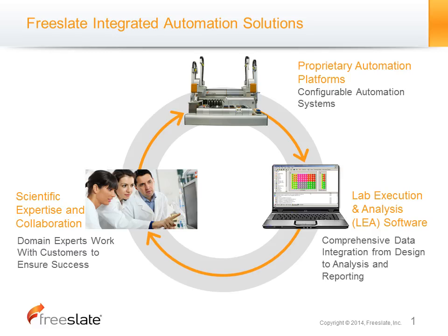Today you will hear a presentation on improving the solubility of your API and new technology developments around automating solvent drop grinding to generate co-crystals. We're pleased to have Poo Sun from Freeslate joining us today. We will conclude today's webinar with a brief question and answer session.